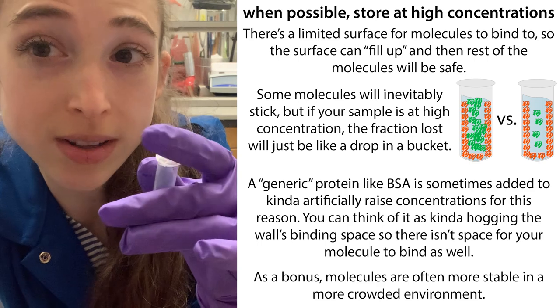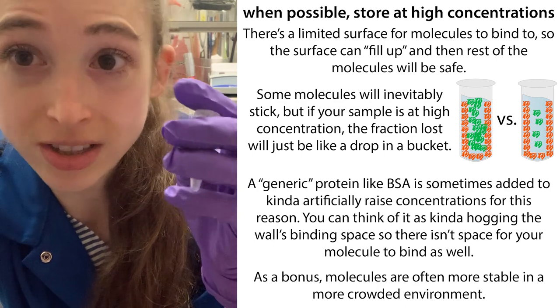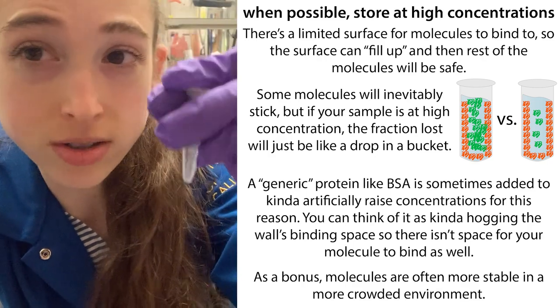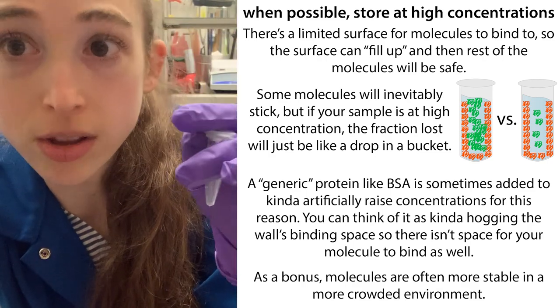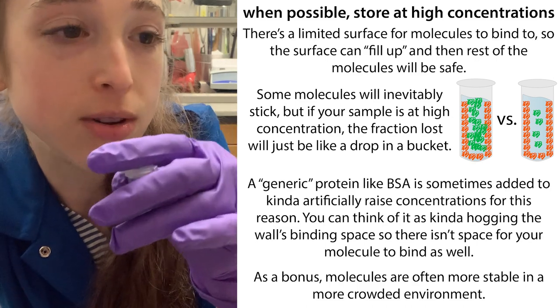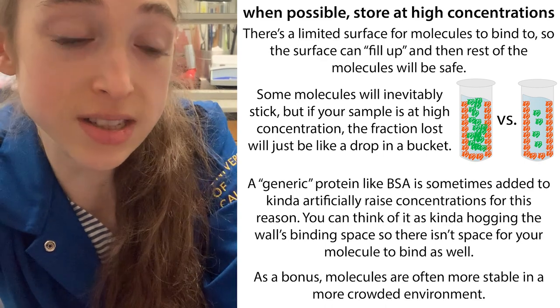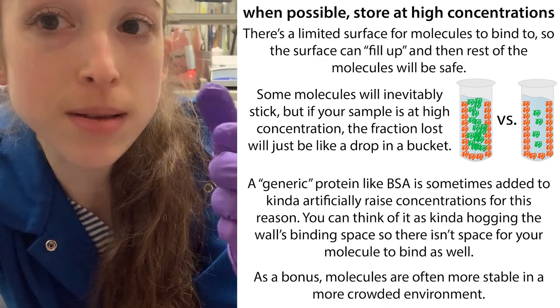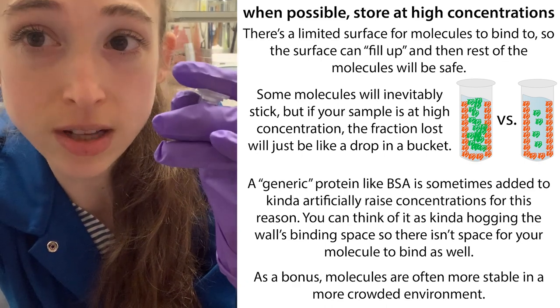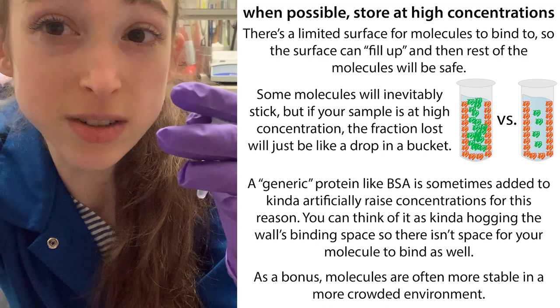Try to store things at a higher concentration — this is for a couple of reasons. One has to do with molecules sticking to the walls of your tube. There's only so much surface area on the walls, and so there's only so many places that molecules can stick. If you only have a few molecules in solution — a low concentration — basically most of your molecules can end up sticking to the wall. The same number of molecules sticking when you have a more concentrated solution would be like a drop in a bucket compared to a drop in a teaspoon with a dilute solution. So with a more concentrated solution, the proportional loss is going to be less.